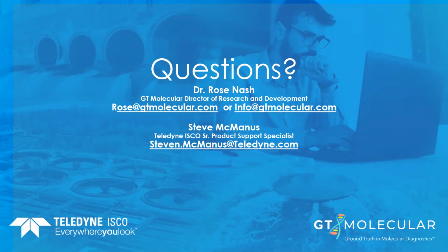Thank you, Dr. Nash. We have 3 more questions here. The first one is: how does this type of testing utilized at the university dorm locations operate? Yeah, great question. So what we have found, we're working with several universities right now, and what we have found is they'll install a sampler at all of their different dorm settings. They usually have one dorm that they set aside as their quarantine dorm.